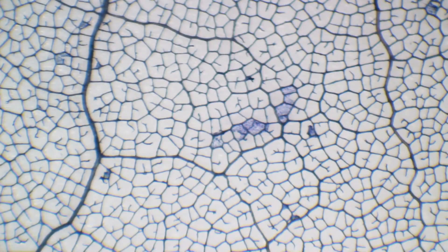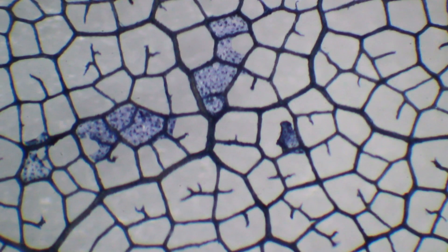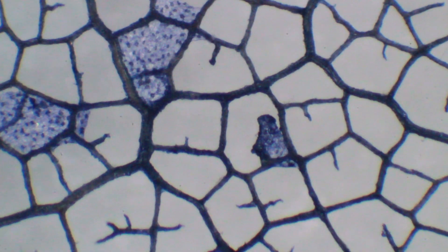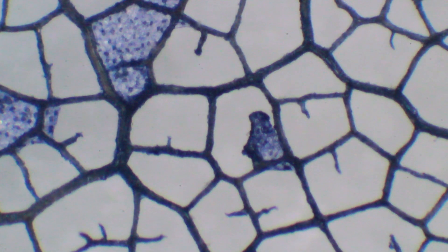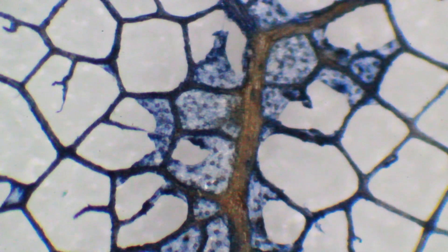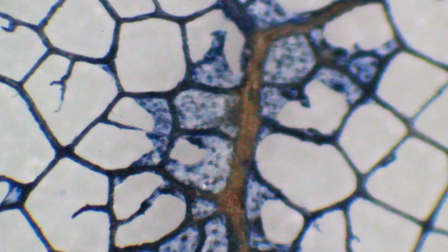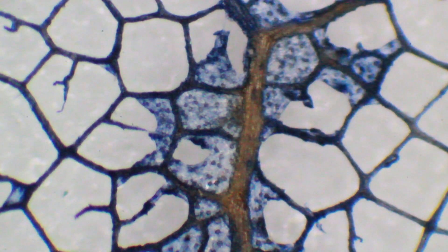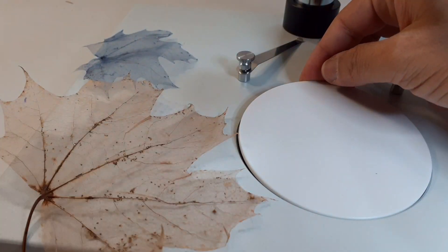Now let's put in the blue leaf — this is now the one that I stained. I'm zooming in a little bit faster. You can see here the tissue that has not yet been removed, and if you look very carefully, you can actually see that there are still some cells left. I think this might be the nuclei that you see here — the darker dots that you see might be the nuclei of the cell. In any case, it's fascinating to see how many details you're still able to see here. I'm not totally happy with the image yet — I still have to optimize my camera system. It is a little bit noisy, so the blurriness is in part because of the camera noise and the low light intensity.